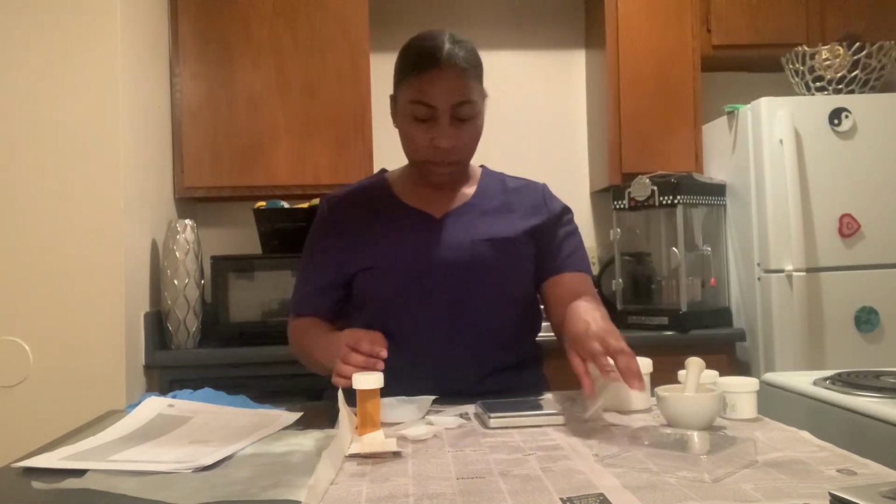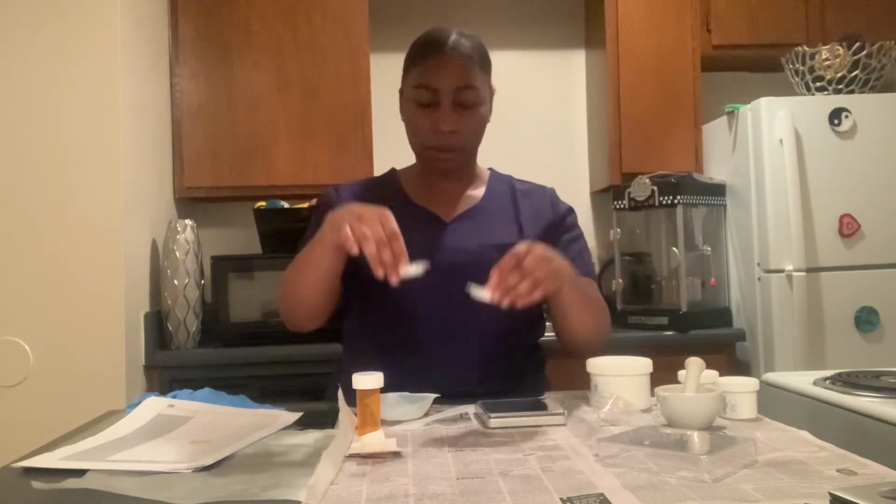So I got everything right here. We have the 10 capsules, and the weighing boats, and the 2 smaller weighing boats. Then we have the prescription bottle where the capsules will go in. We have the alcohol pads to clean everything off.